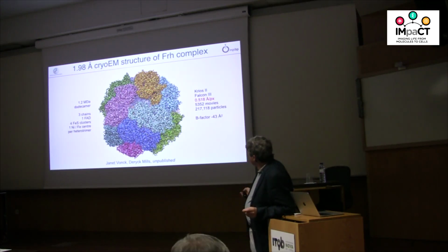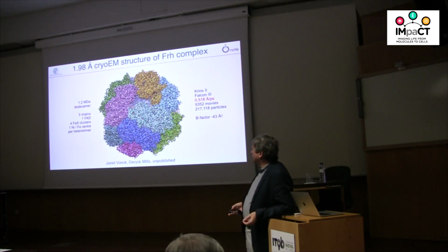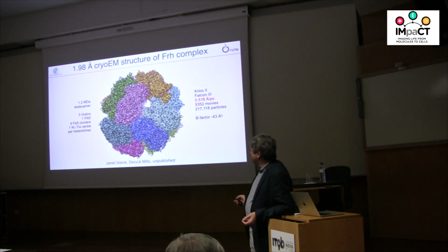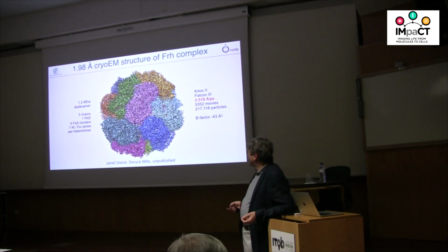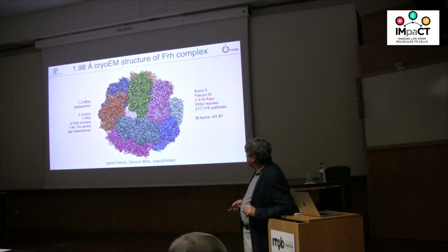data at high resolution. So this is a smaller pixel size, a lot more particles, and you get a much better B factor, and then you have a structure. It's not so easy to see now because there's so much detail. The eye doesn't take it in, but you can begin to see these cofactors that shine through the holes between the residues here. But if you now again turn it, it's a dodecamer of these 12 heterotrimers. It's no longer easy to see the helices, but they're of course still there. But there's still too much detail.